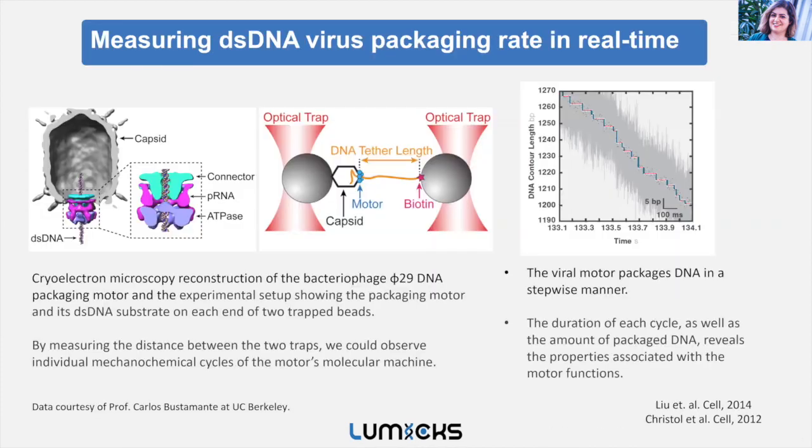And at the end, I will just mention very quickly the application of the same technology, but without looking at fluorescence, in DNA packaging. In this case, DNA packaging by a virus, a bacteriophage. Here is just a cryo-EM reconstruction of the bacteriophage motor and its capsid. It basically packages DNA into the capsid.